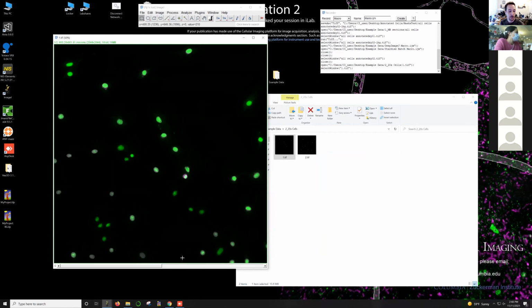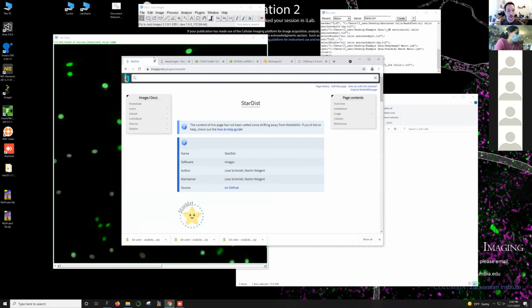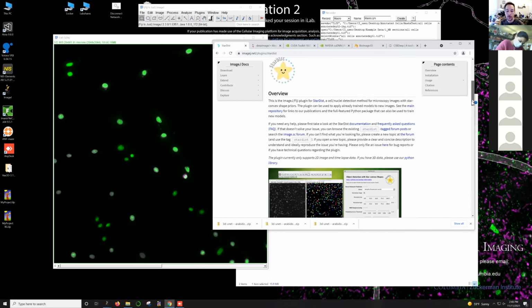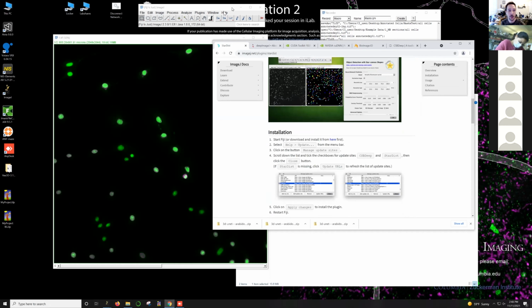And if you want to have more information on StarDist, here's the website for it. You can just search for StarDist and microscopy, and this will come up. It's very easy to use, and it's very easy to install. I can show you now how we would install it.